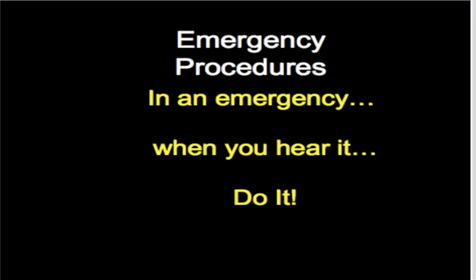Remember, in emergency procedures, when you hear it, do it. That doesn't mean get your phone out and start talking to your parents. It doesn't mean talk to each other and be loud and yell and scream. It means you have to be quiet, immediately shut off any lab equipment that you may have on, and then listen for instructions, because the teacher has to listen for instructions over the PA as well.